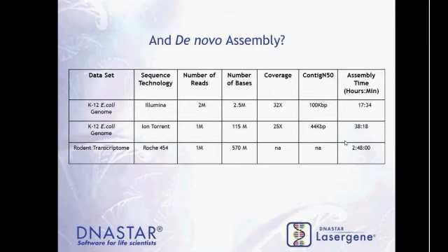And it usually takes anywhere from 2 to 6 hours to do that assembly. But really, for de novo assemblies, it's not so much the time that it takes to do the assembly. It's more, what is the quality of the output?